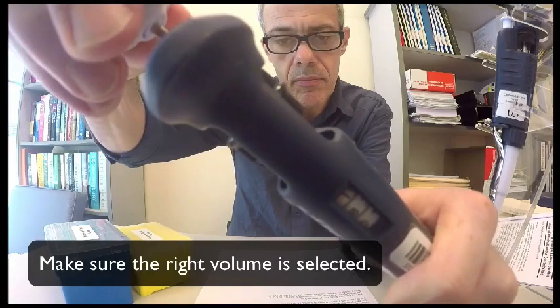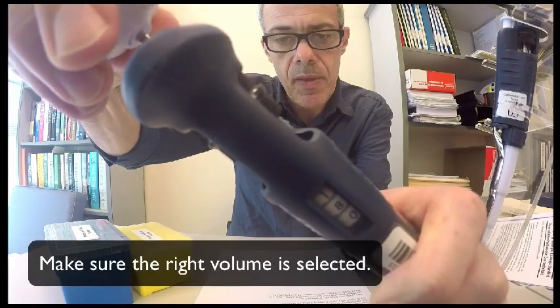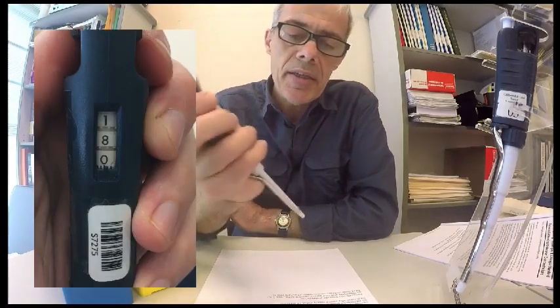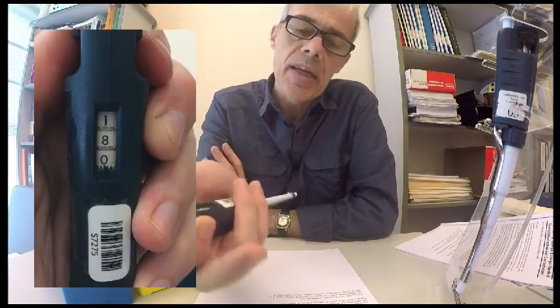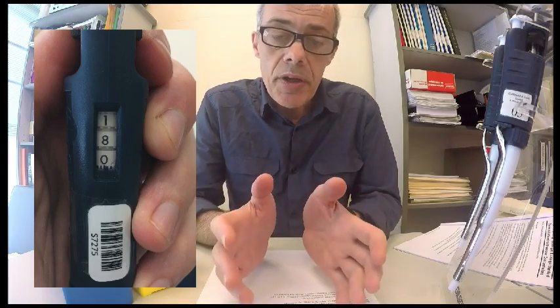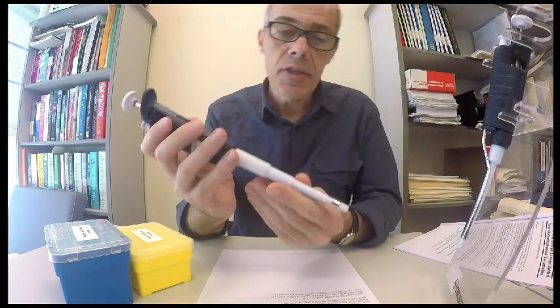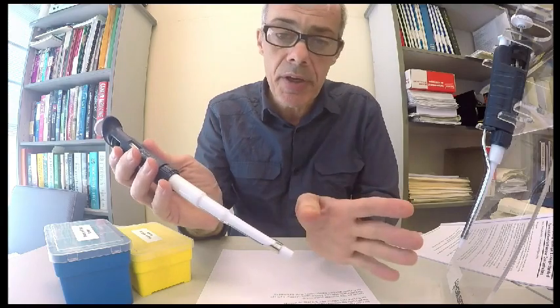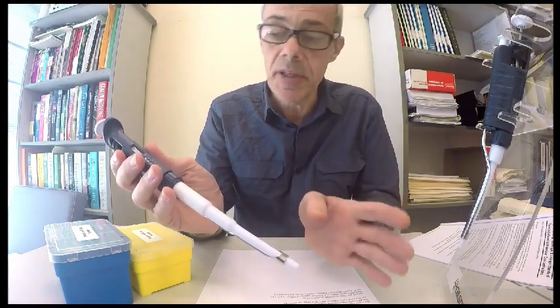There you go, 180. So that's going to dispense 180 units of something, and that is 180 microliters. Okay, the next thing you need to be clear on when using pipettes is putting the right tip onto the bottom of the pipette. So this is a pipette, but it doesn't have a tip on the end, so it can't be used until it's fitted with its tip.